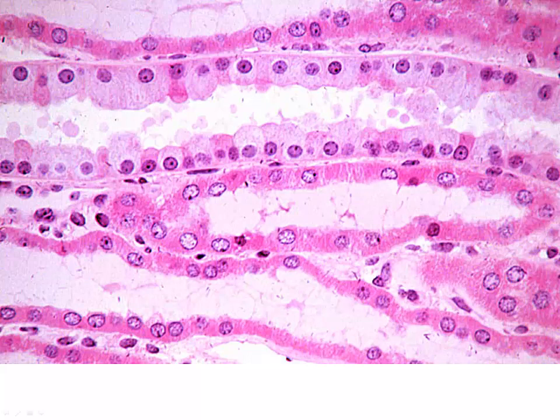Once again, we have a nice view of a collecting duct. We're also going to see some of the thick portions of our loop of Henle, and we're not going to worry about those quite so much. I'm much more interested in you being able to identify collecting ducts and distinguishing the cells of the collecting ducts versus what we'll find in our cortical labyrinth between proximal and distal. So we're going to focus on this collecting duct.